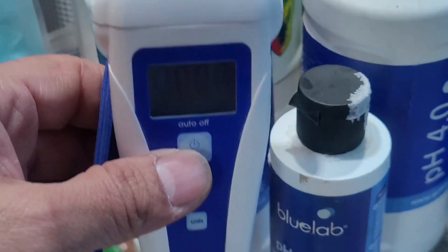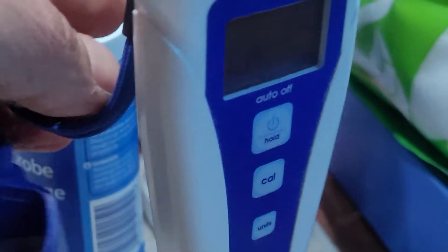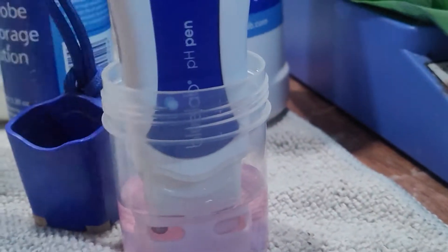In between dunking — in between the 7 and the 4 — you want to make sure it's clean. Just rinse it off in tap water. You don't ever want to use RO water in this guy. This here is the second solution we're using — number 4. Same thing: hold the button, calibrate it, and make sure you're leaving it in there soaking.